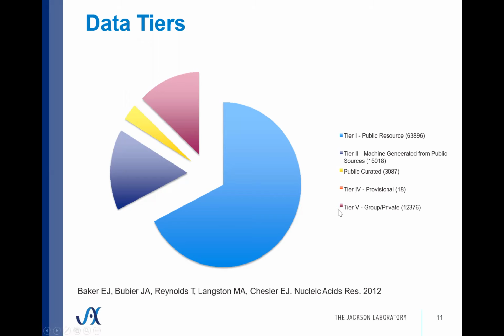And tier 5 are data that you have uploaded for your own private use. Any analyses that you run are going to rely on that set of data in addition to all the other tiers, but only users that you've designated as members of your group to which you've shared that set of data can access it in their analyses. So Elissa, can I point out something real quick here?